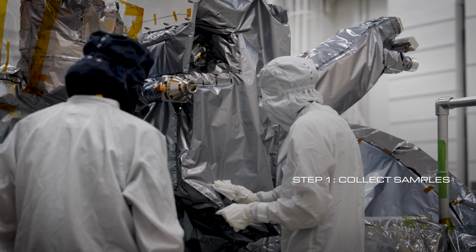This is the lab where we process all of our flight support samples. We want to get the samples back to our lab as soon as possible because we want to capture this look at our samples before any bacteria can die. So I need to take this wipe that we use to sample the spacecraft surfaces and get it into this bottle. And then I'll add some soapy water to this. And then from there, we're going to shake off all of the bacteria into that soapy water. We physically shake it, and then we also use the sonicator. We are using sound to finally shake all of the last little bacteria off into our soapy water.